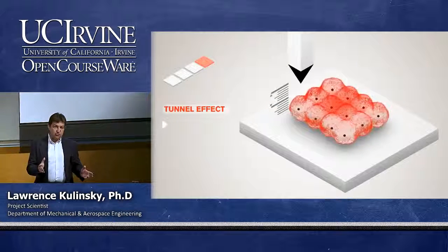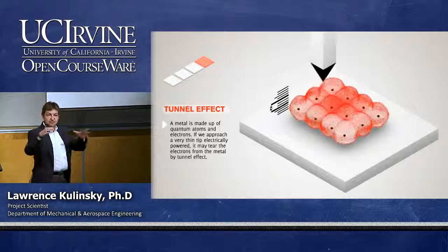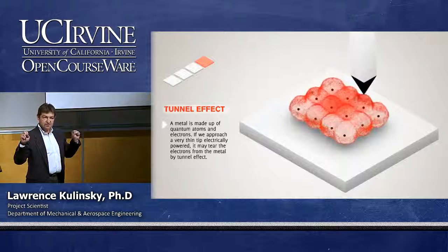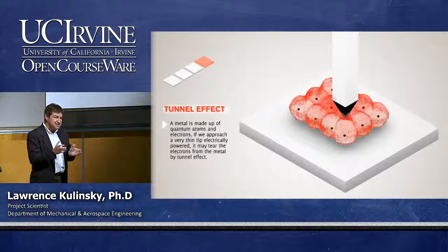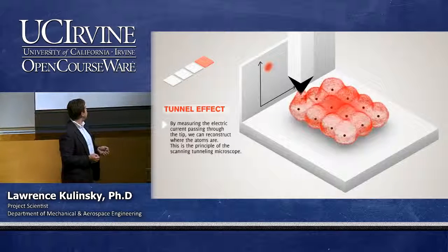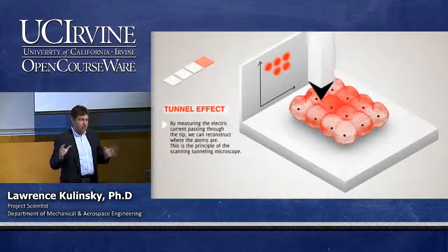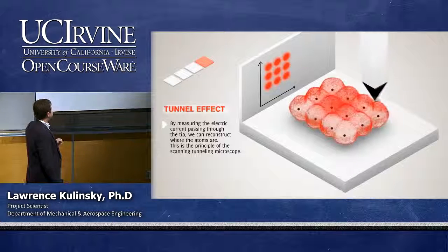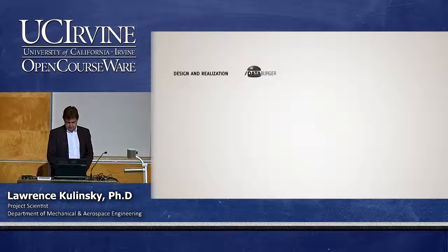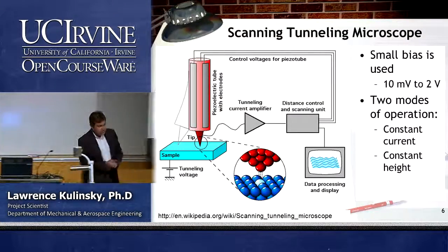And now this is how the tunneling microscope works. As you get the probe closer and closer to the atoms, the electron clouds start to overlap, and you can actually sense each individual atom, right? So when we see the atoms, we don't actually see the atoms, we see the electron clouds. In physical terminology, we see the electronic density of states, okay? So this is how it works.